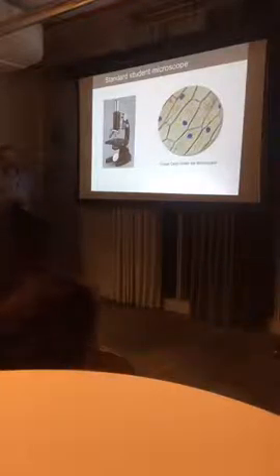Certainly, if we remember our school, it could be a simple microscope that most of the students are familiar with, how it looks. It's an old-fashioned microscope, still using a mirror, and this is our sample. Most people know it's like an onion. If we mark the nuclei a little bit with methylene blue or other dyes, we can see the nuclei. Our gate to biology. These are the toys that we had before, and now we have more expensive toys.